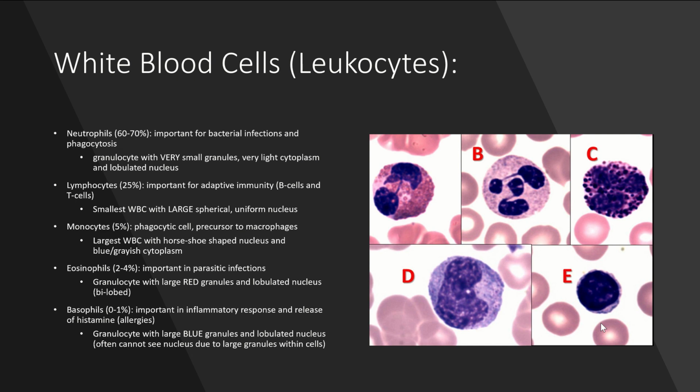They're also very small, very perfectly shaped, very round and perfect looking, and that's how we're going to identify our lymphocytes. The next one, so this is where they start to get a little more rare, a little harder to find, are going to be monocytes.